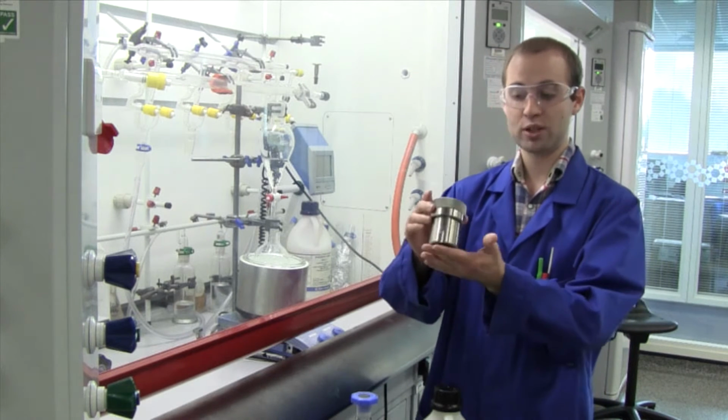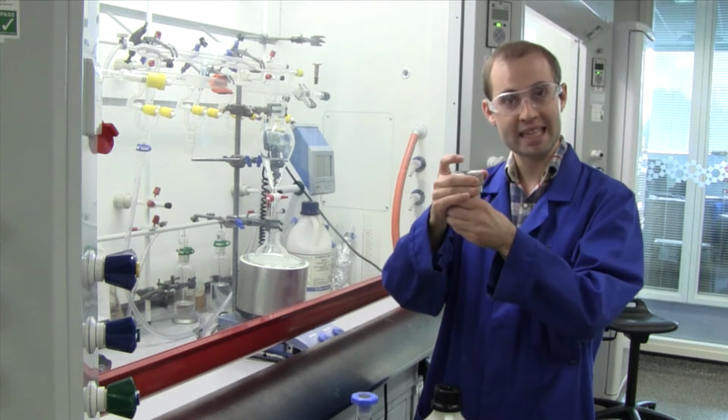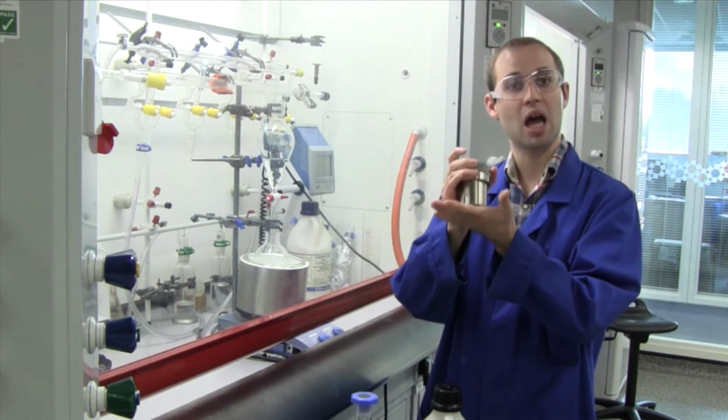In the lab, we can do this using a hydrothermal bomb. By heating this up and sealing this steel lid closed, we can create high pressures.